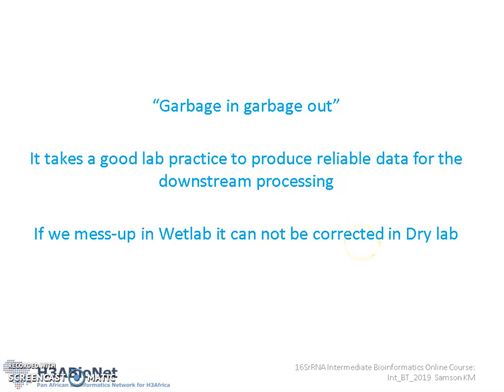This concept is very critical for all researchers to understand, because if for some reason there was a problem introduced in the dataset during the lab processing, like the PCR or the labeling, for sure this mistake will be carried on to the sequencing platform and later to the bioinformatics, and it may end up with the wrong result for a given research question. So it's very important that we check the quality of the raw reads before we do further processing, to ensure that we don't waste energy and resources processing data that will make no sense.